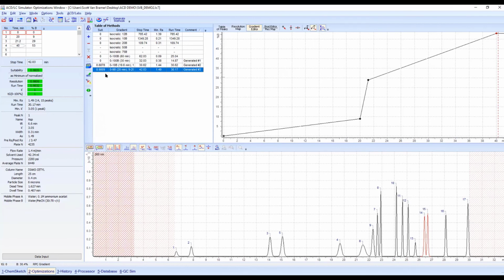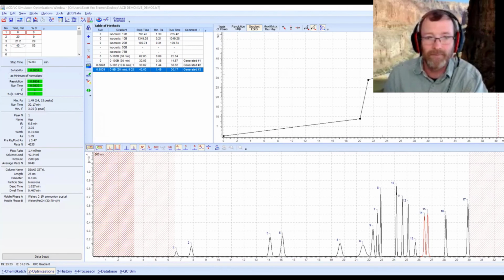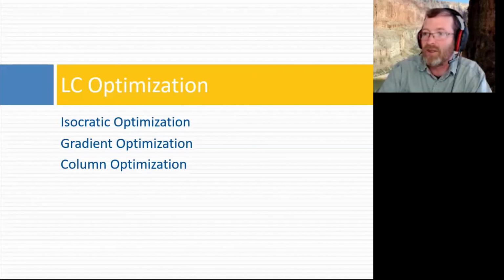And so that's what I did with my students. I walked them through this, and based on this, it seems like they were able to learn a lot about experimental optimization, the different parameters that are available for liquid chromatography, and how you might go about doing this experiment.